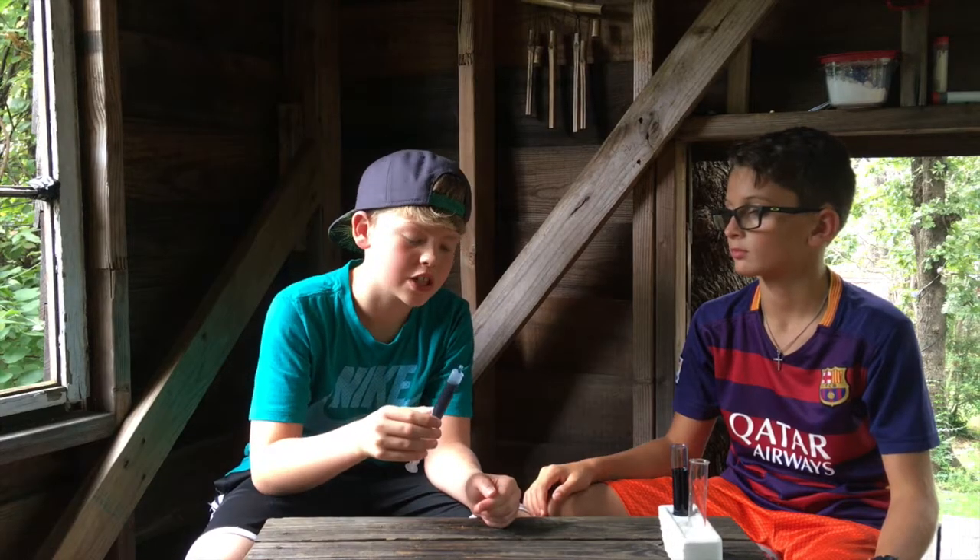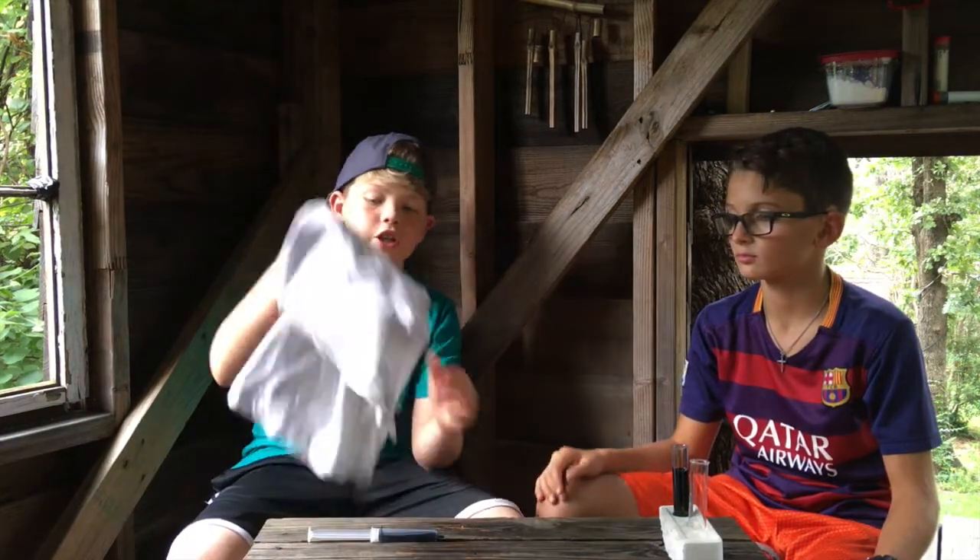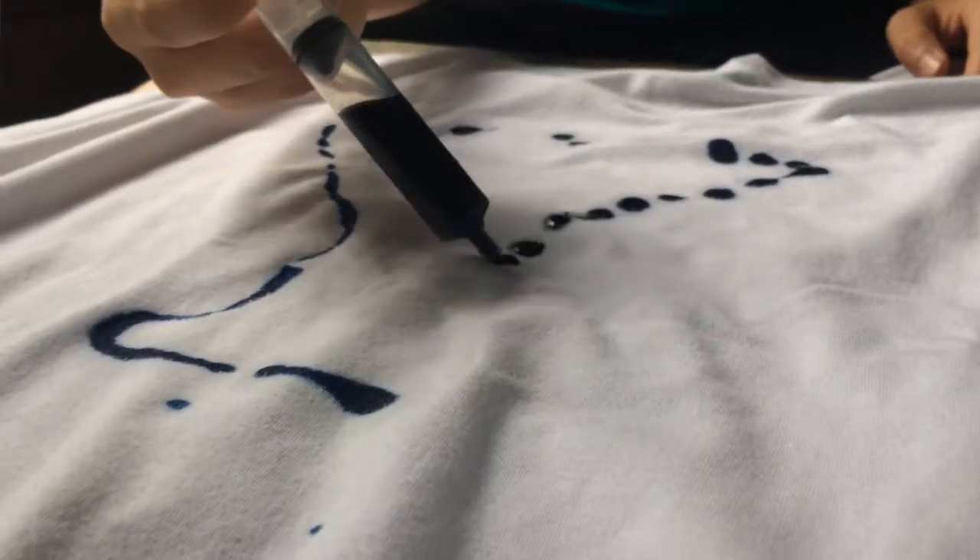Alright guys, if you have a syringe you might want to syringe it up, because we're going to put this stuff to the test. We're going to use an old t-shirt. That's blue!